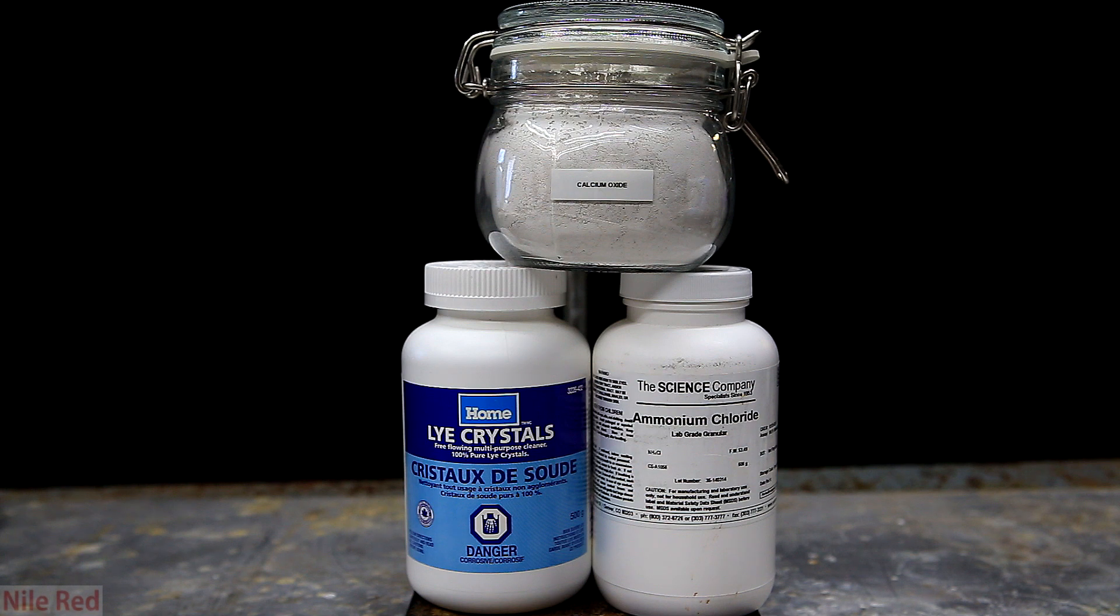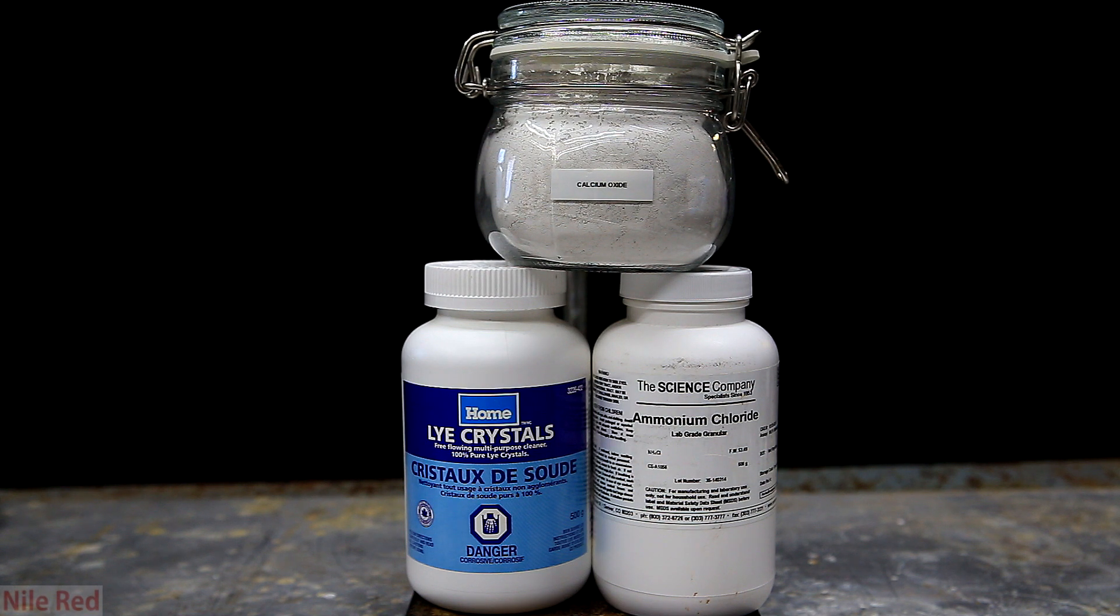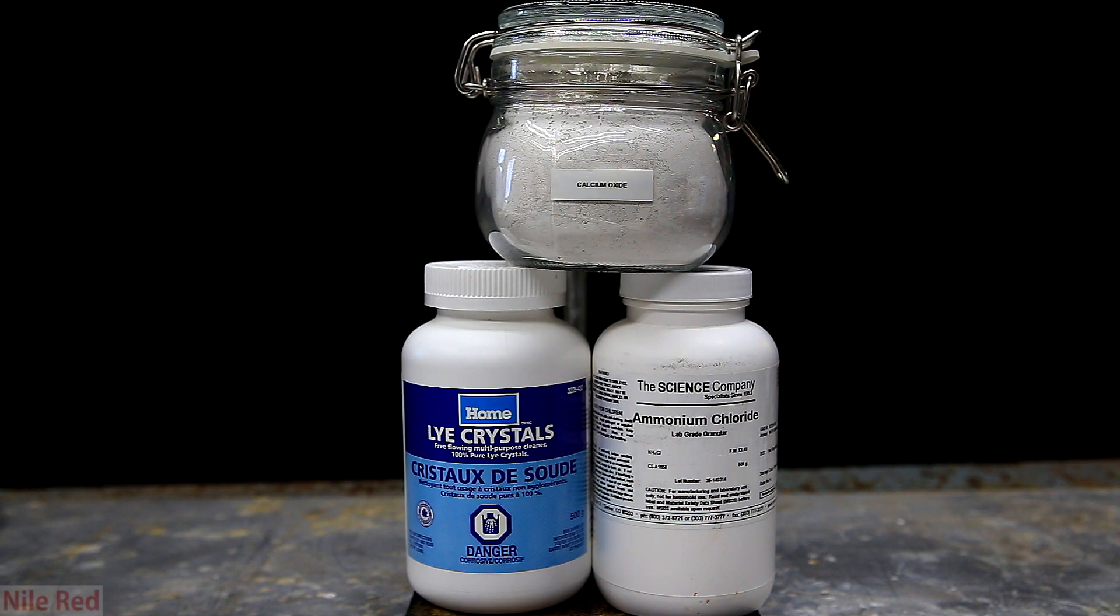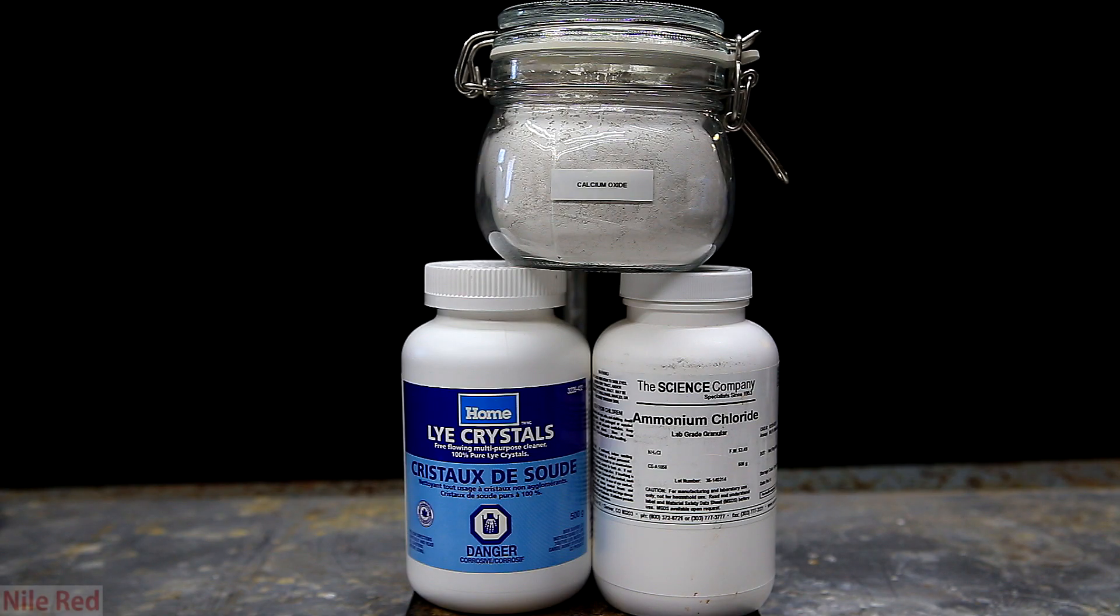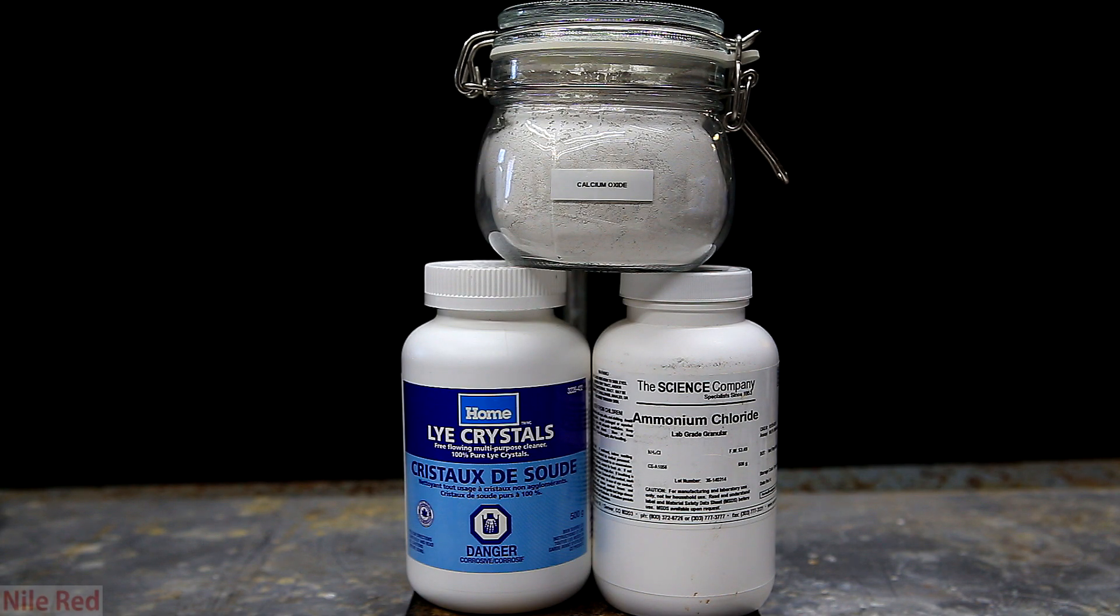I should note that there are a few different ways to generate ammonia gas, and this is just one way. The other two ways are mixing urea and a base, or by simply boiling an ammonium hydroxide solution. Anyway, enough with the theory, and now we can get started making our ammonia gas.